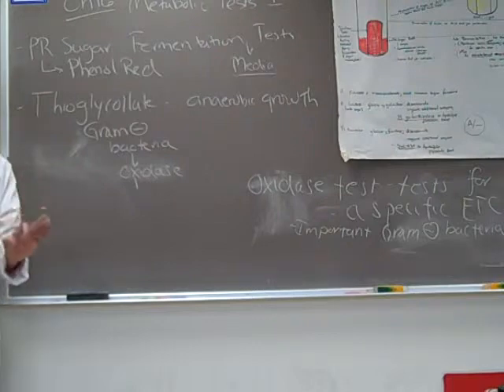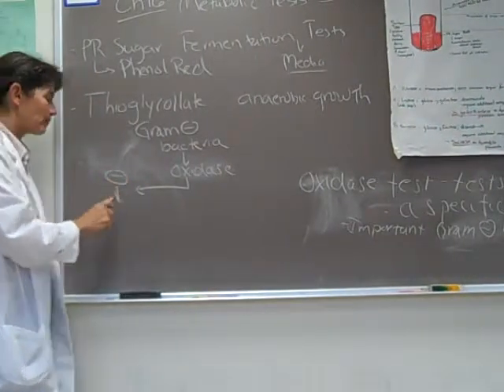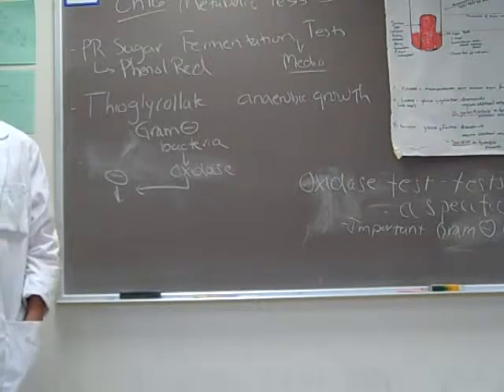just information I'd like you to know for the lab practical is if we're oxidase negative, this is classic for that huge family, Enterobacteriaceae.